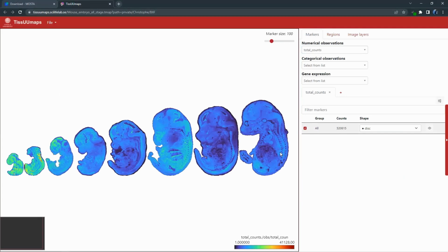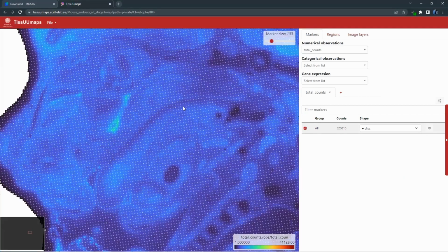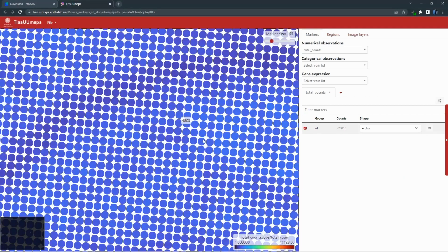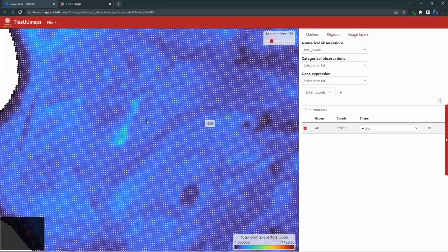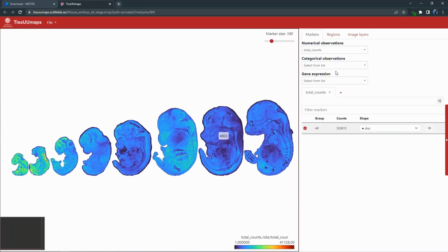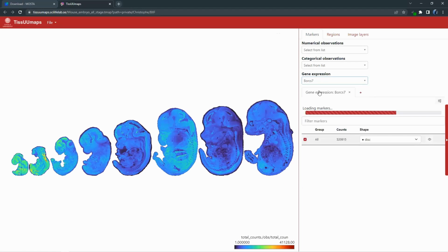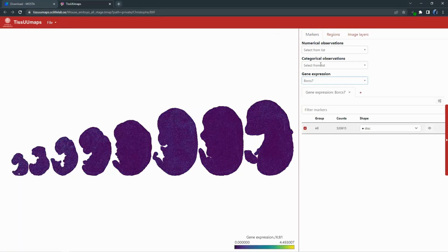If it was our publication, we could also share the data as part of the publication, and people can go in and look at each point or select some part and export as CSV, or they can display one gene and so on. So it's very flexible in what you can do with that. You could also edit the file to put what you would like in it.